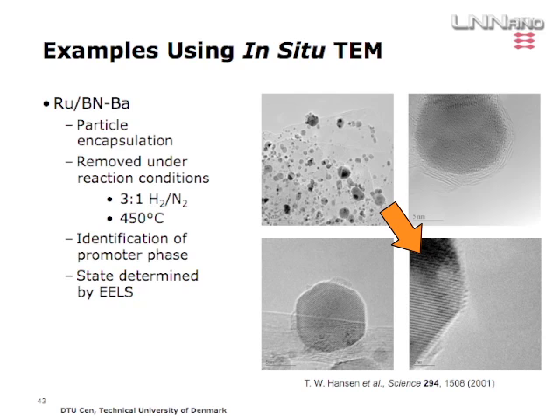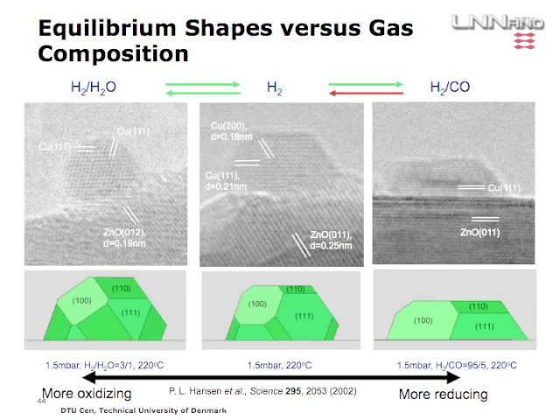We were lucky enough to get this published in Science back then. And we also determined the state of these compounds sitting on the surface, and did in fact determine that they were barium-containing compounds.